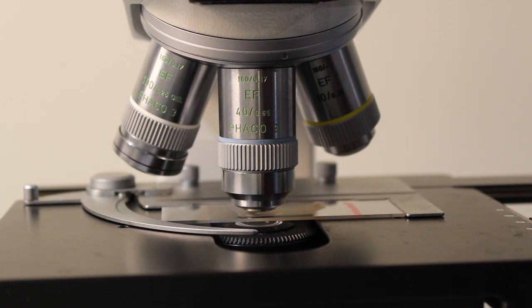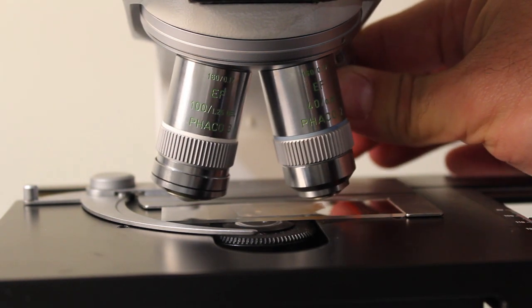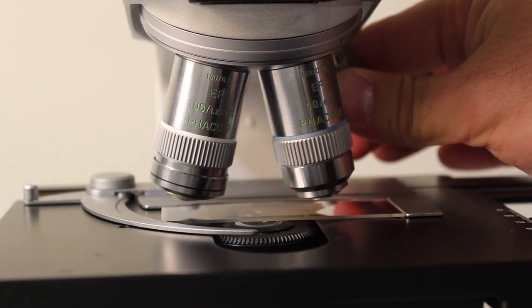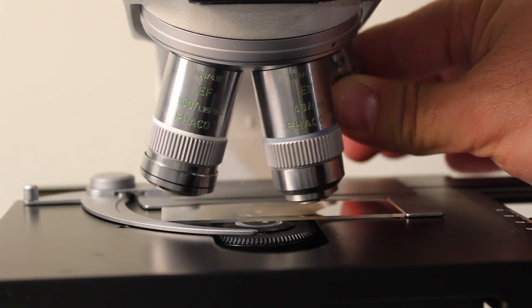Now, one thing that is important is whenever you're switching between air lenses, so that is lenses that image the sample with nothing between the lens and the sample itself, you want to be very careful not to rotate in an oil or a water objective lens because if you do this incorrectly, you could damage your most expensive lens on your microscope.